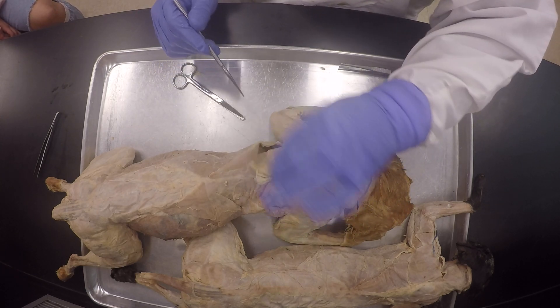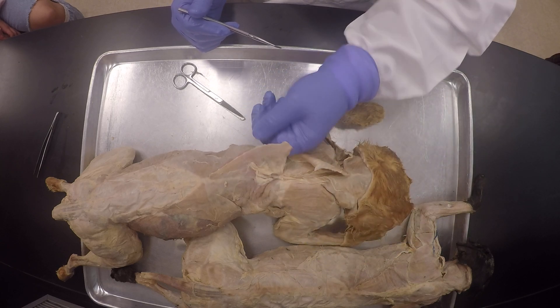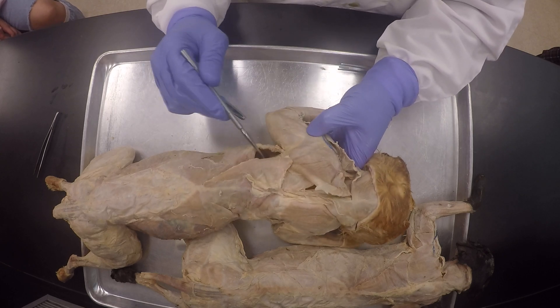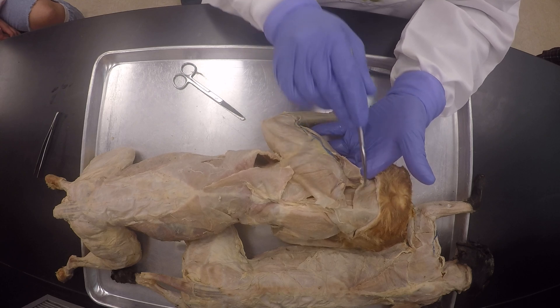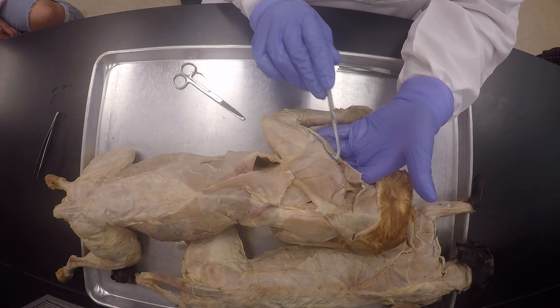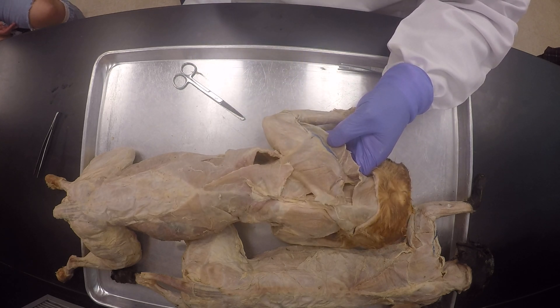You want to do that. Once you separate the spinal trapezius, then you have room to go to your latissimus dorsi. Then you just finish this off — you follow the line here, noting that at the junction of the clavotrapezius and the clavodeltoid, there's going to be tough connective tissue, so you want to work through that, as well as avoiding the blood vessel if you see it right there.